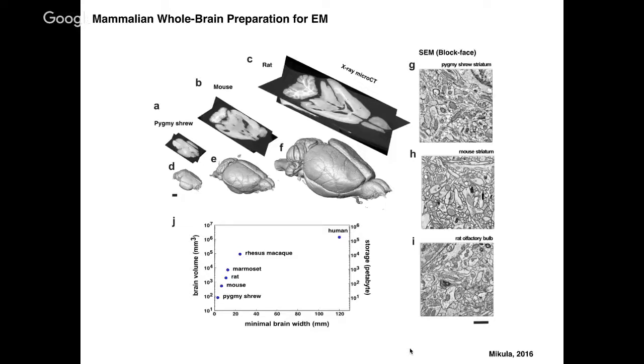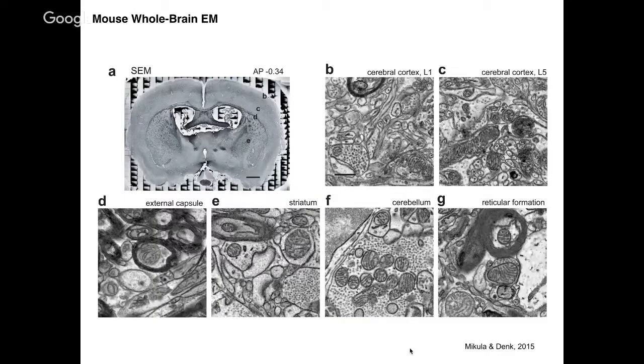But let's focus a little bit more on the mouse brain and see whether BROPA is in fact suitable for something like a brain-wide circuit reconstruction.